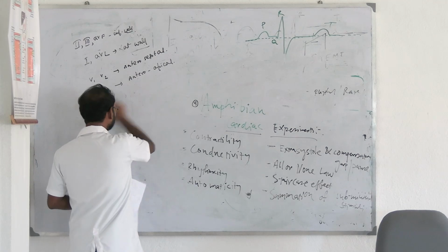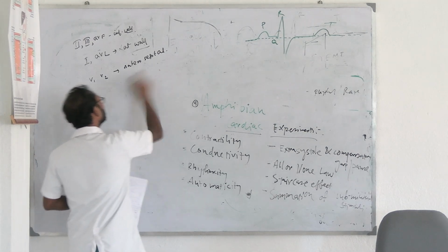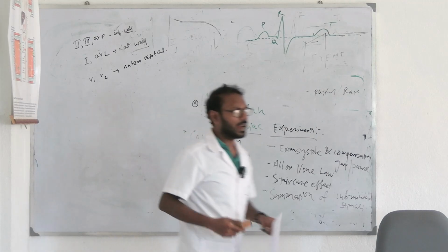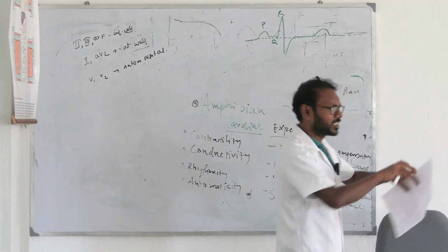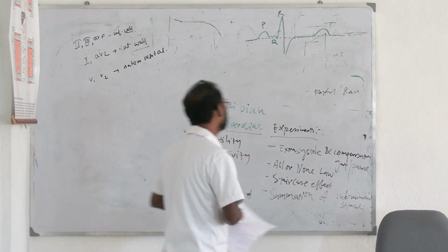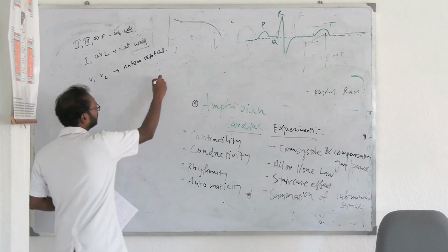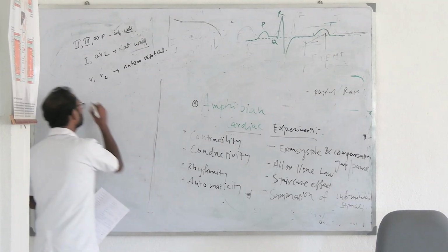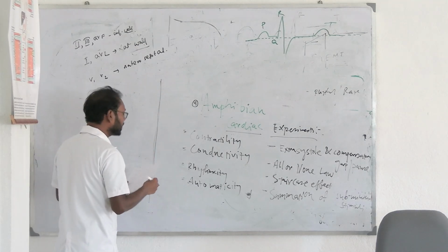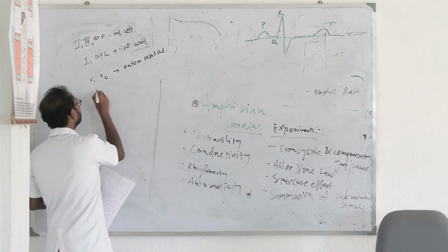and ব্যাংটাকে আমরা উল্টো করে রাখি, we turn the frog around, and its belly side is kept above, and the heart is actually measured by the help of a few things. It is called kymograph. জিজ্ঞেস করতে পারে যে কি কি তোমরা নাও, what are the instruments used? So লেখো kymograph.